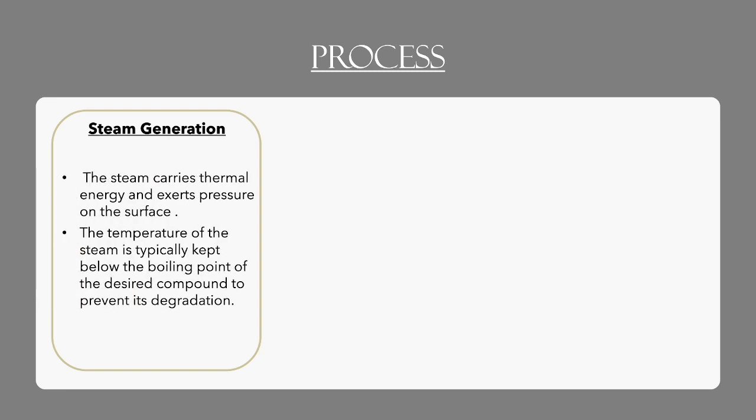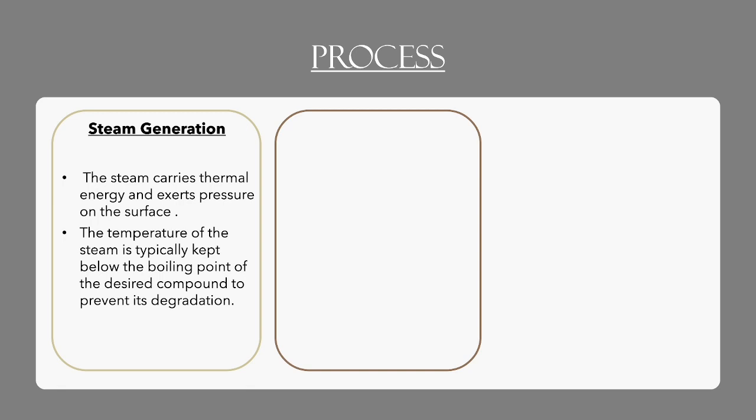The basic process of steam distillation consists of steam generation. It is used in industrial processes in which steam carries thermal energy that exerts pressure over the surface. The next step is contact with the material.